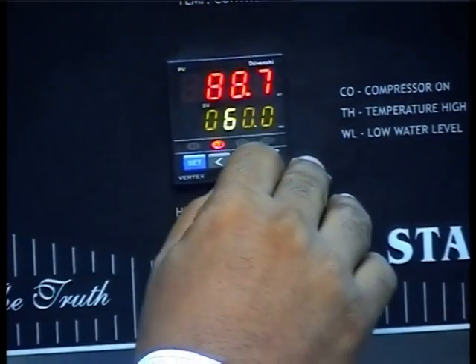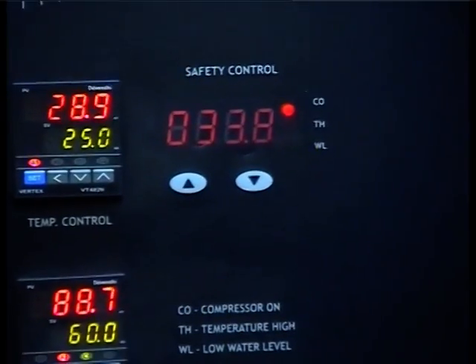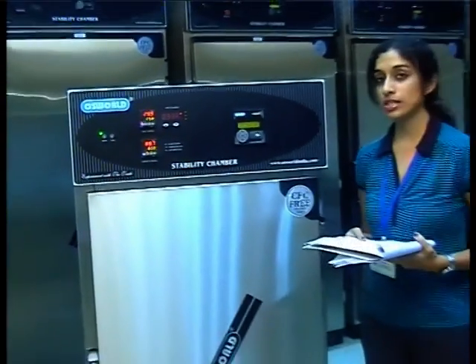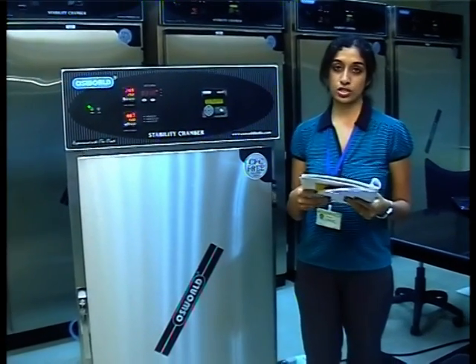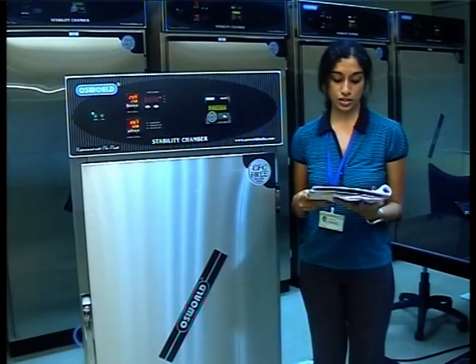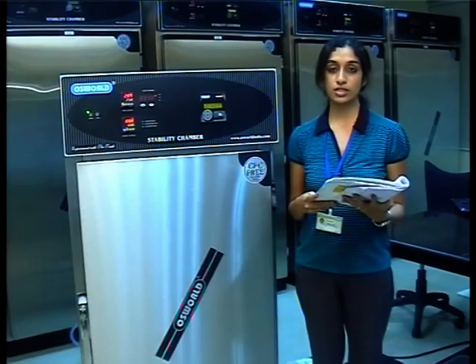Set the safety controller to 29 degrees Celsius. Once started, allow the equipment to stabilize, which may take an hour or more. Observe that the temperature will drop from its present value, which is again close to room temperature, to the set value of 25 degrees Celsius.